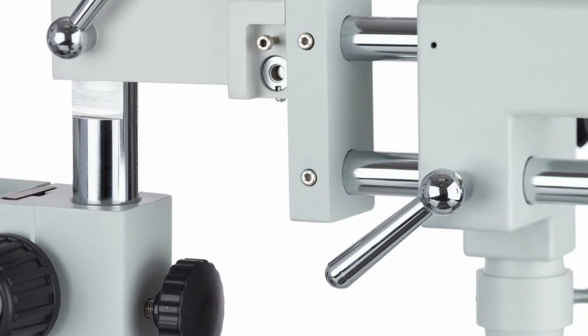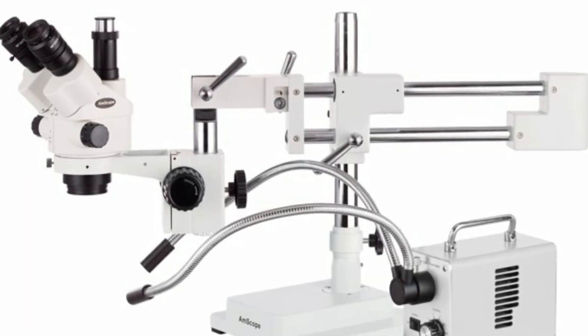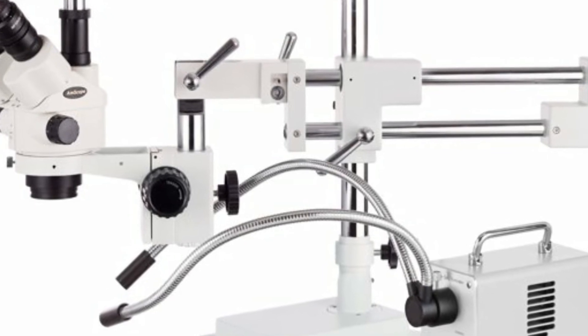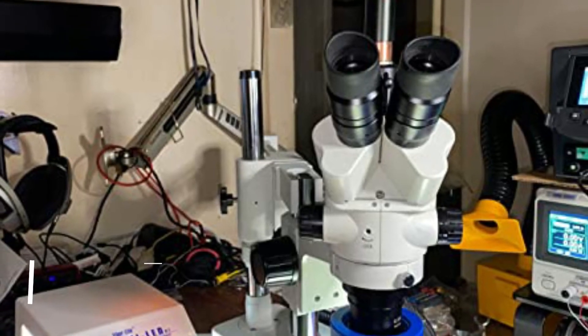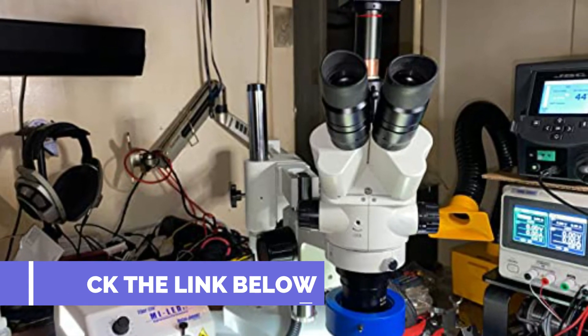10x wide-field eyepieces provide an ample magnification range from 7x to 45x, with high eye-point optics to accommodate glasses or goggles. The ocular tubes are not equipped with dioptric adjusters, so focus is more consistent. Focusable eyepieces are included to compensate for vision irregularities and are available in various optional magnifications.